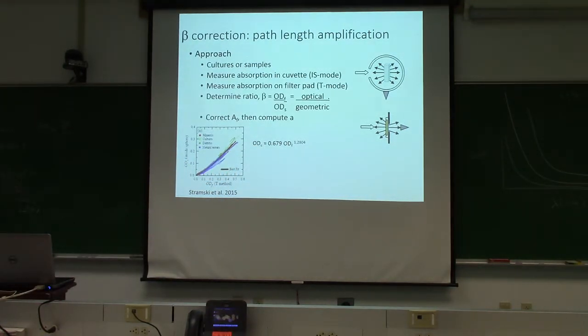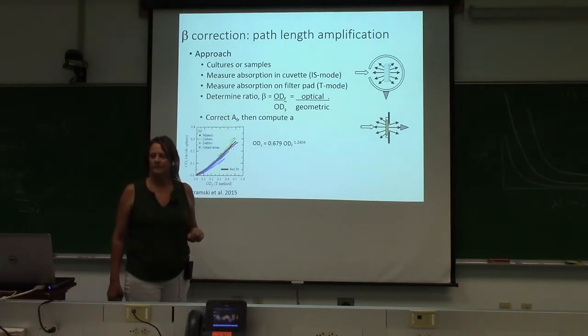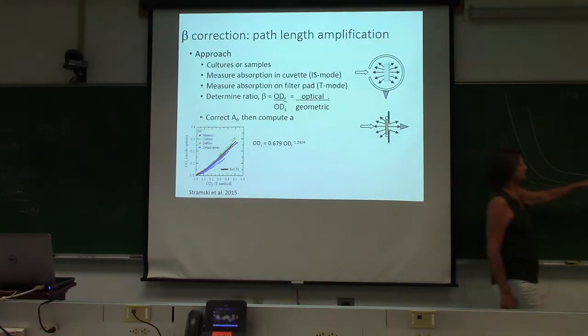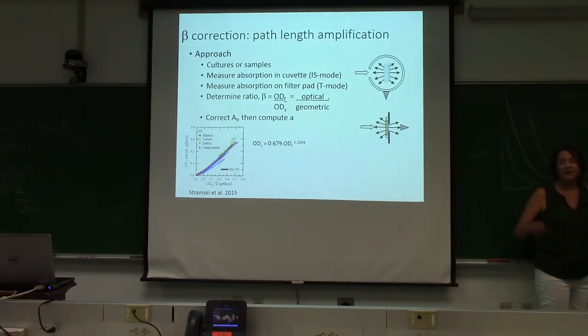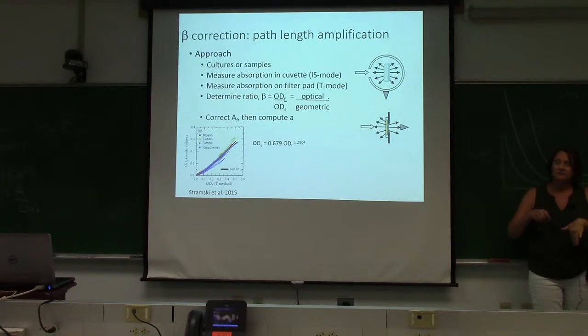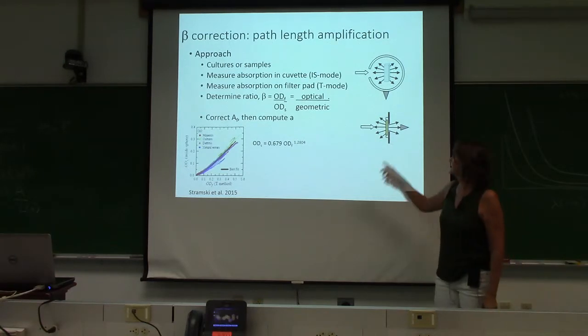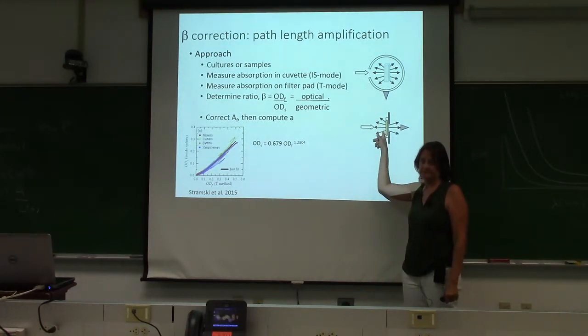So again, you would do this correction factor for your filter absorbance, and then this is the number that goes in right here. Just so I can understand, the upper one is water, right? It's a cuvette with your whole sample in it. You take out the water absorption out of it to do this? Yes. So you would first measure your whole sample in a cuvette. Then you would filter it, and you would measure the CDOM essentially, and subtract that.